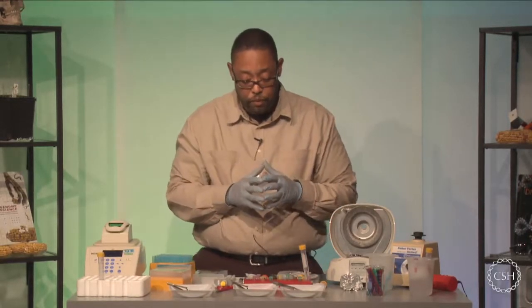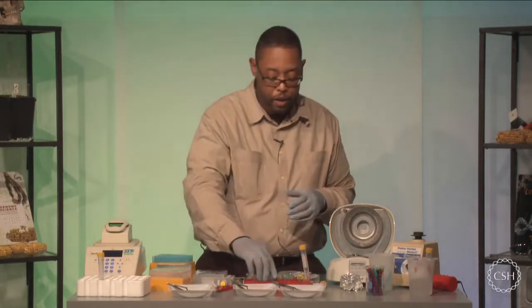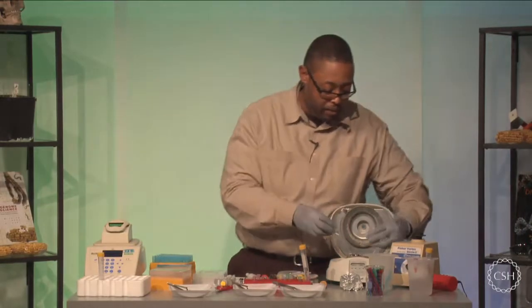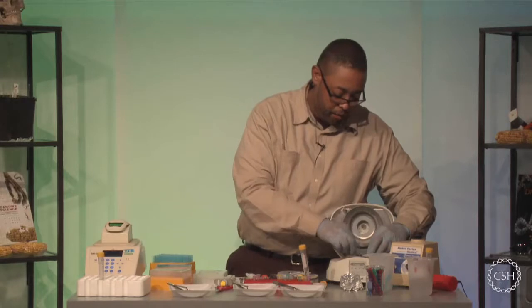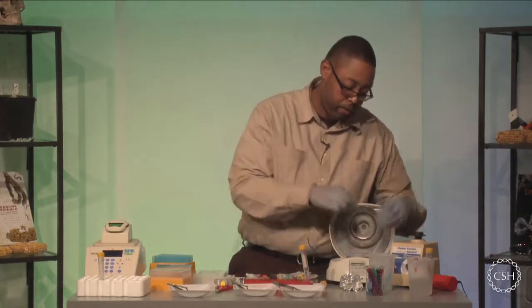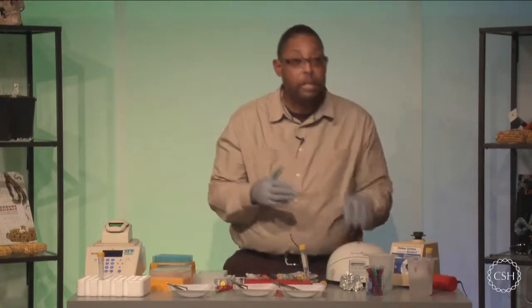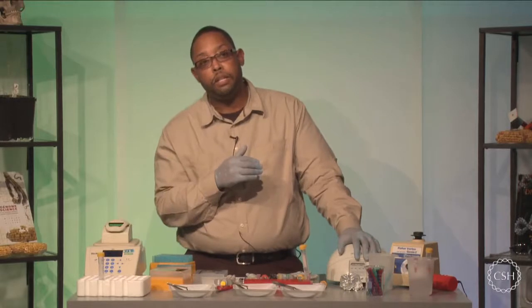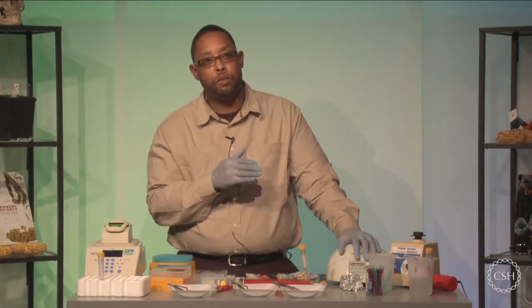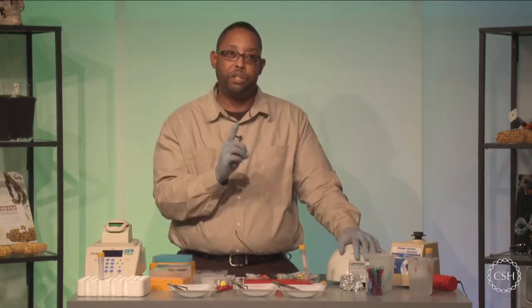Now, once we're done with this first resuspension in the wash buffer, we're then going to place the sample back into the microfuge and spin down the samples. This is going to allow us to repellet the sample back down to the bottom of the test tube with our DNA, and we're going to take that wash buffer off and wash one more additional time.